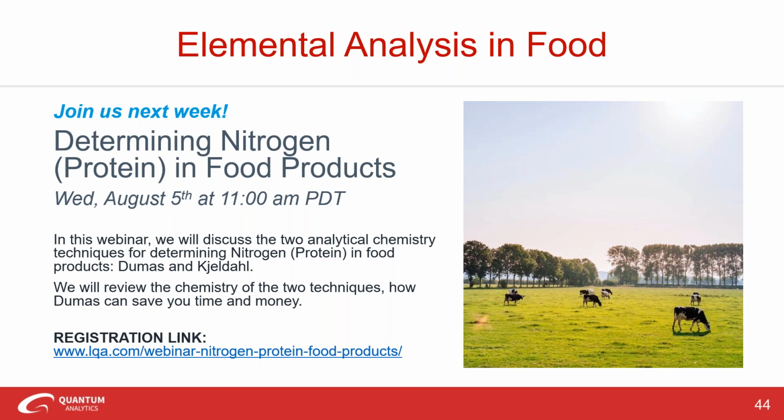Awesome. Some good questions coming in. Next one is, how high can XRF detect sulfur? How high? Usually that's not a question I get. Usually with sulfur, I'm asked how low. So this is great. You can go as high as you need to, all the way up to 100%. Let's ask how low you can go.